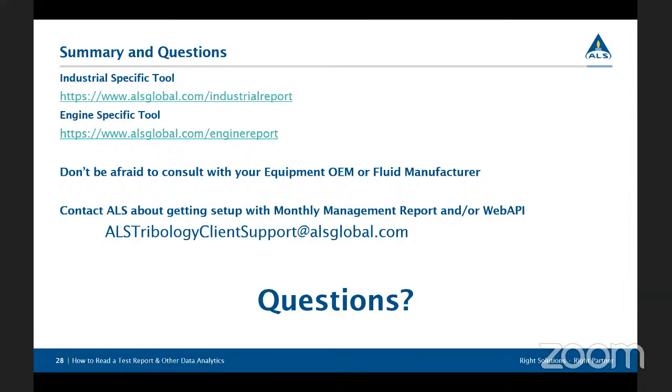If it's just sitting there, is it slowly oxidizing? So you'll want to run perhaps an oxidation test or a total acid number just to see if physically that oil is changing. Hopefully that was some good information for you, Mark. Definitely feel free to reach out if you want to chat about it more.